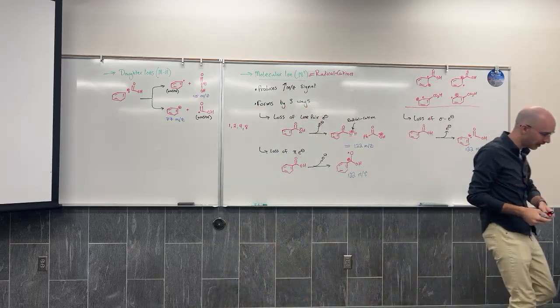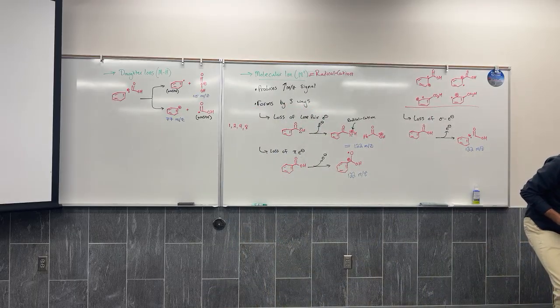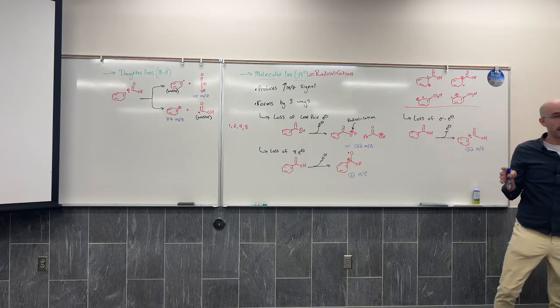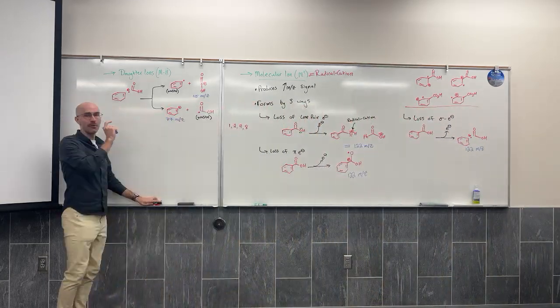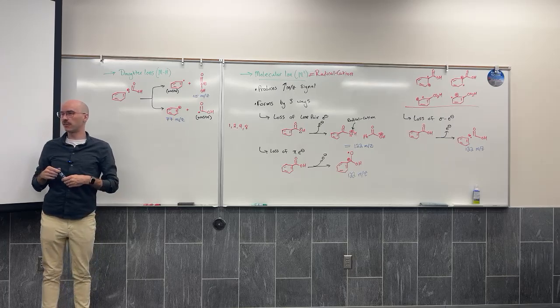Do we see a signal at 77? It is. It is the next biggest signal, at 77. And I know it's kind of hard to read in there, but it is a signal at 77. So we can name these signals.